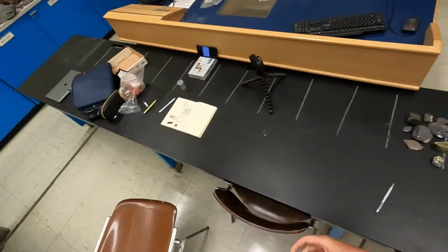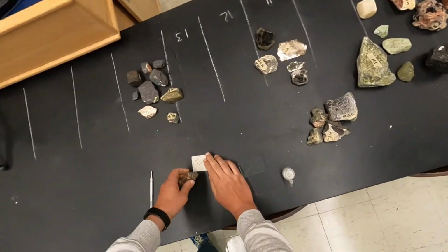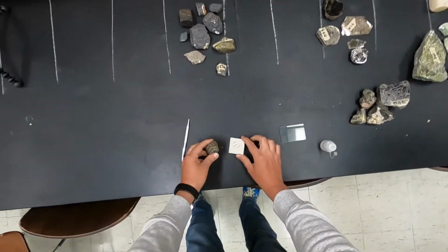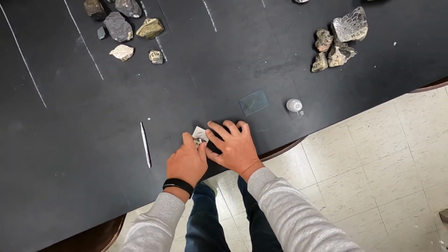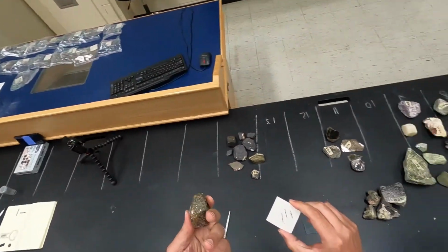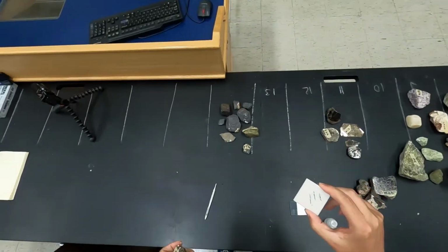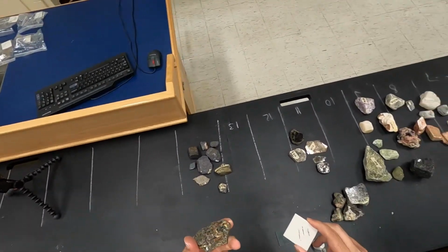The streak is usually a good way to tell things with these minerals. So you can see a characteristic yellow to whitish streak. I think that's another important way of telling that this is not your hematite or magnetite. You can see a yellowish streak, which is quite helpful in the identification of sphalerite.